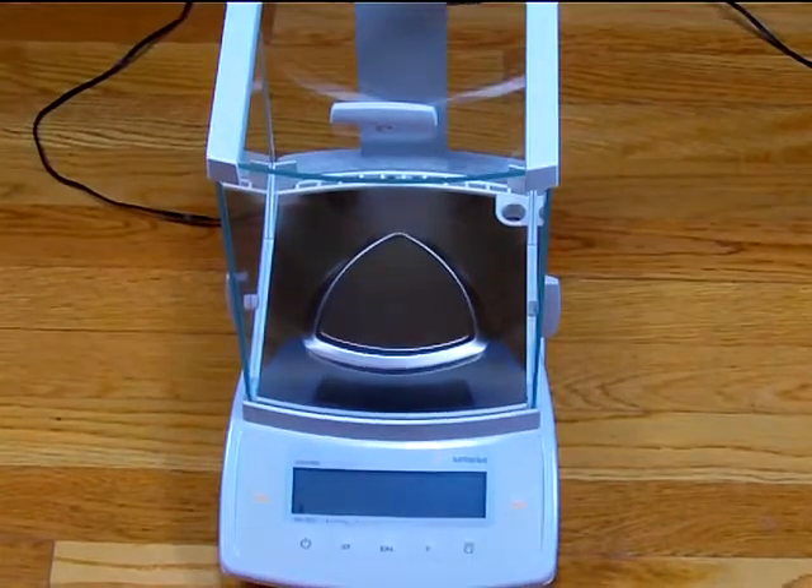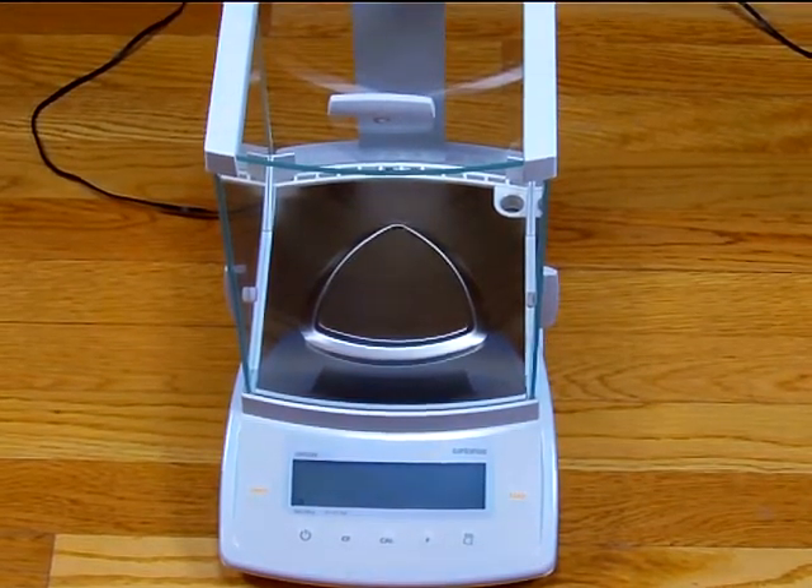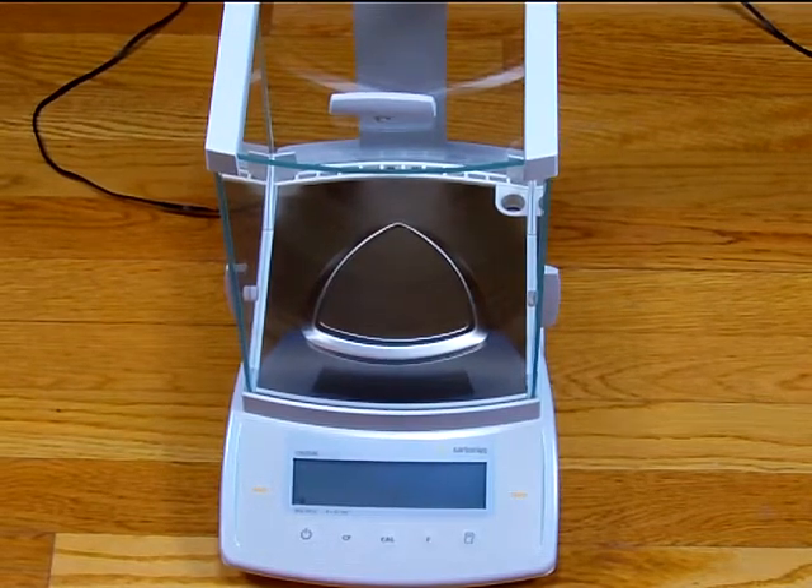The balance features a three-year limited manufacturer warranty from Sartorius USA. The balance is assembled in Nevada, Colorado.